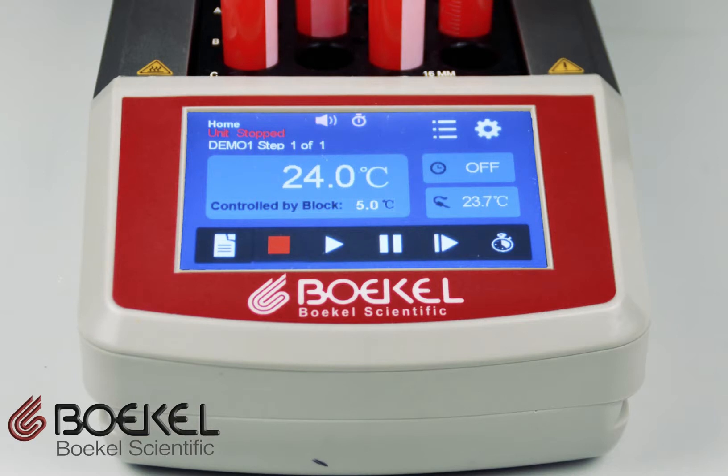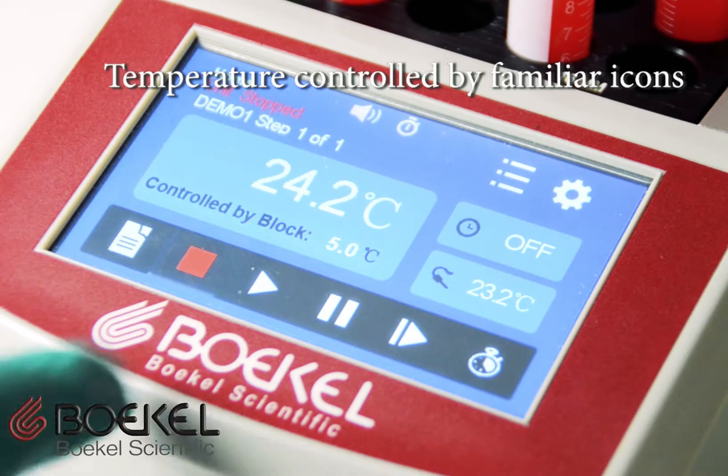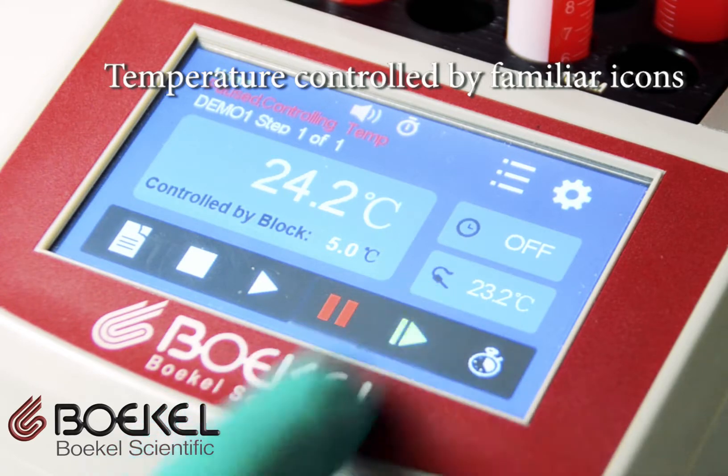On the home screen you can easily find the most important parameters including current temperature, the set temperature, and the amount of time remaining in the cycle. The familiar stop, start, pause, and skip icons control the unit temperature.